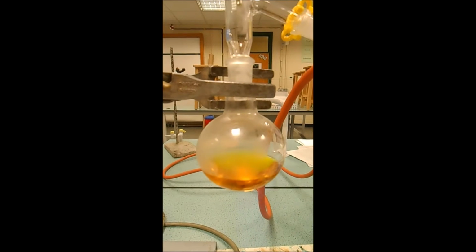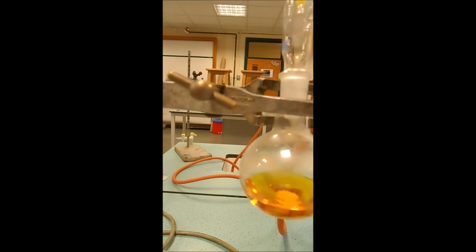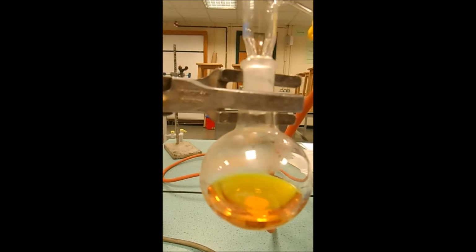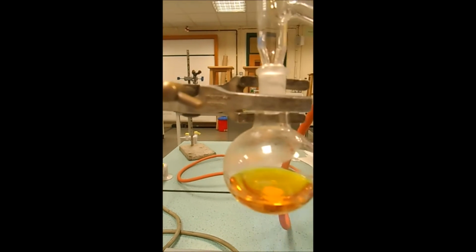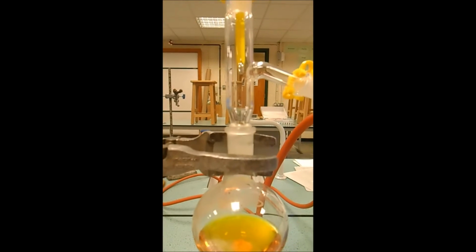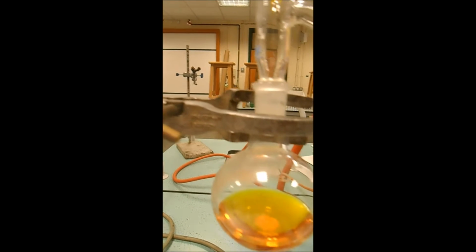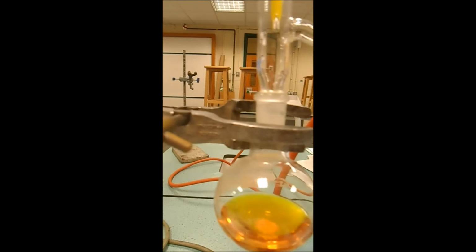Okay, I'm going to look for it condensing on the sides. You see it's clouding up there, and then I'm just going to take it away for a minute. Okay, the Bunsen burner is just going to sit at the side, and then I'm going to reheat it. I'm going to do this gently. I'm watching the temperature at the top, which currently says about 23 degrees. I'm going to keep heating, but I want slowly that temperature to rise.